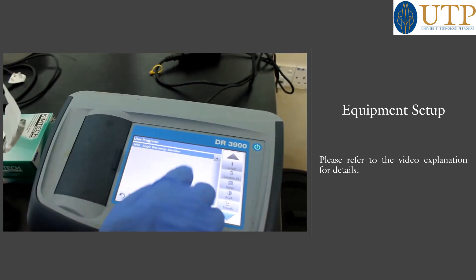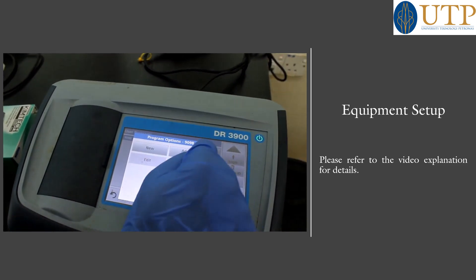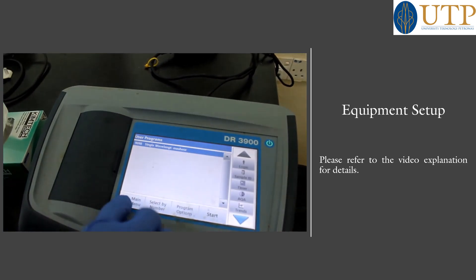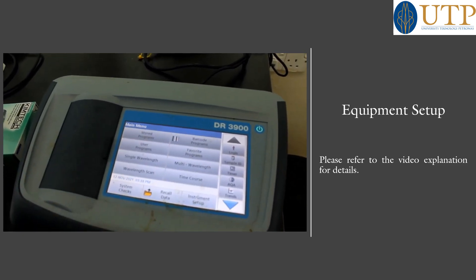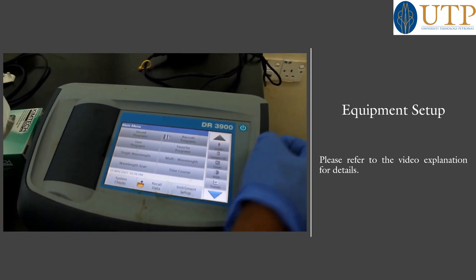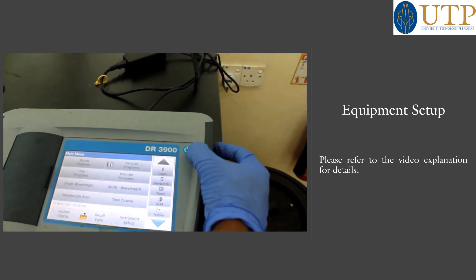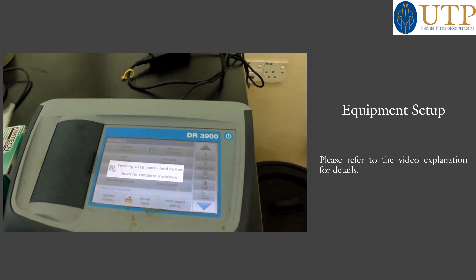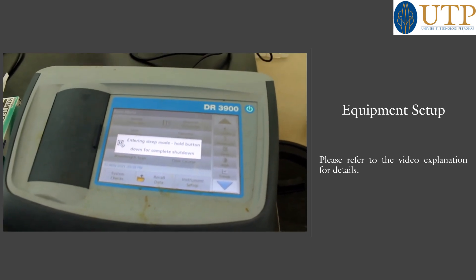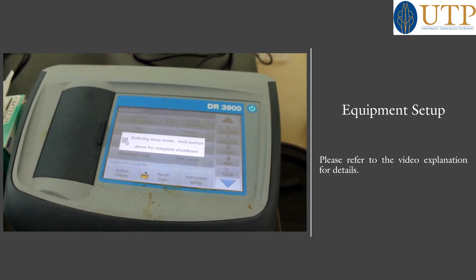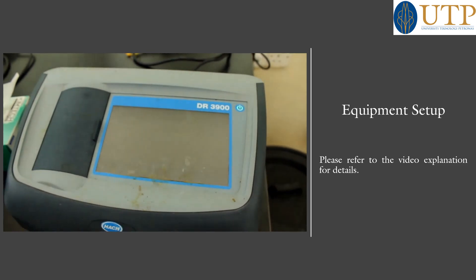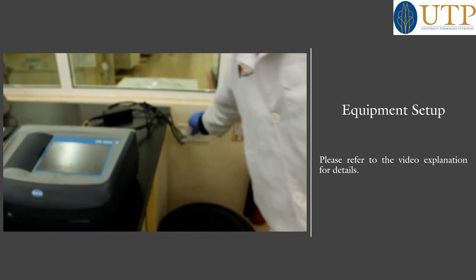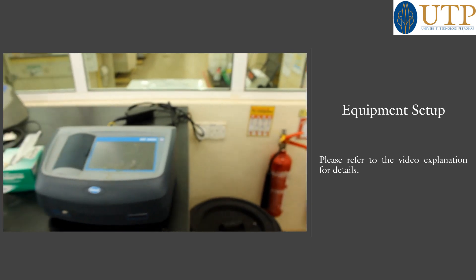In the programs menu you can add favorites, add new, edit, or delete programs. When you are through, you can safely turn off from the power button. And don't forget to switch off the socket as well. Okay, thank you everyone.